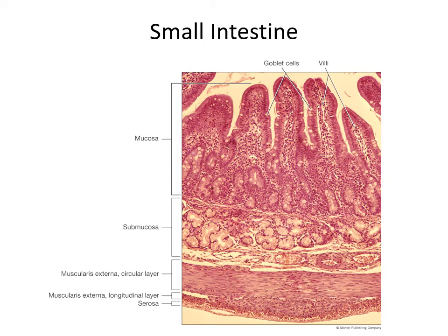Moving into the small intestine, we're going to see a new feature which is villi. These are finger-like projections of the mucosa and some of the submucosa. These serve to help increase the surface area in the small intestine to facilitate digestion and absorption. So again we have mucosa, submucosa, and our muscular layers — outer longitudinal and inner circular — and the serosa, which is the connective tissue around the outside.